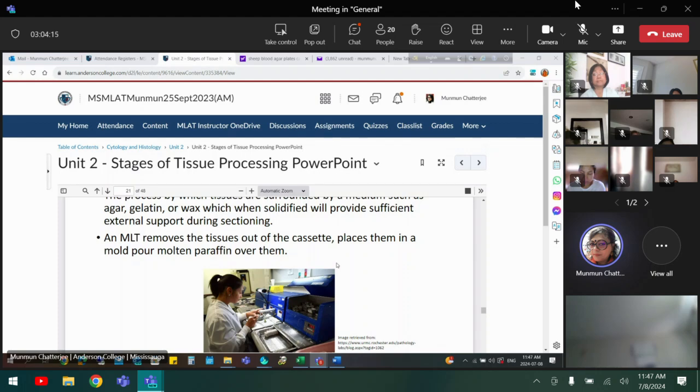Or the bone tissue and others are hard, so they have to be decalcified. After you decalcify, they become soft. They cannot get support to cut in the cutting stations. So that's why you need to embed them in a medium which is flexible and hard, giving enough support, but it's not like crystal or stone, so that this paraffin can also be cut along with the section. And these paraffins, or the embedding media, give better support for sectioning of the tissue.